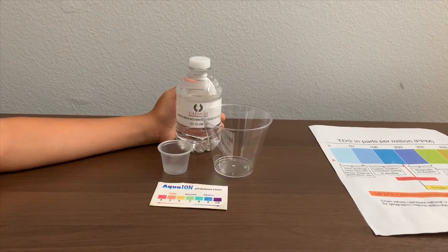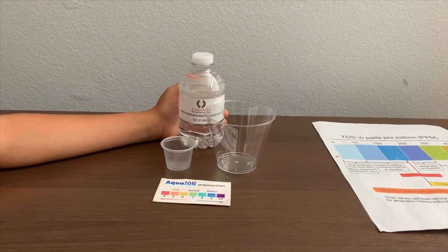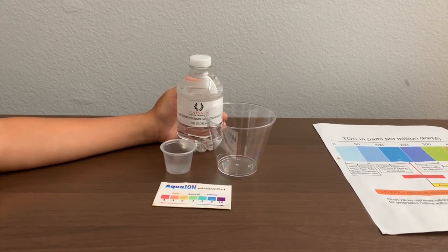This is Caesars Purified Water with Minerals Added for Taste. It's sourced from Nevada. Let's test the pH and TDS levels.